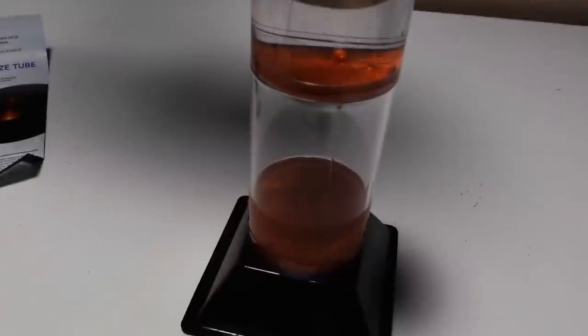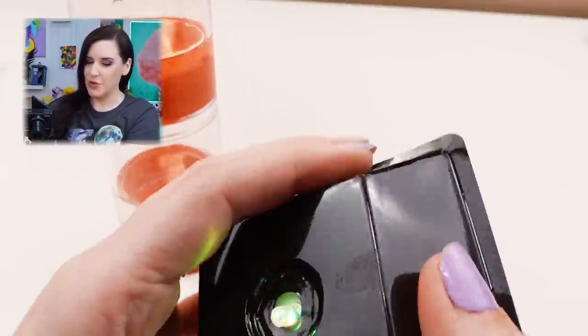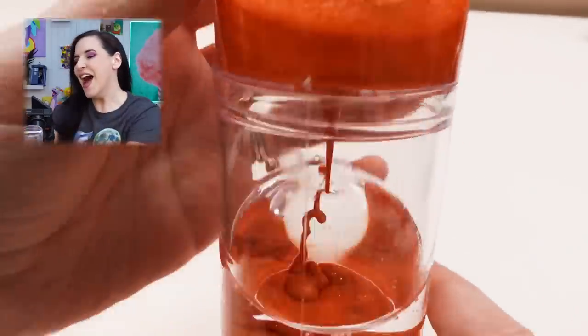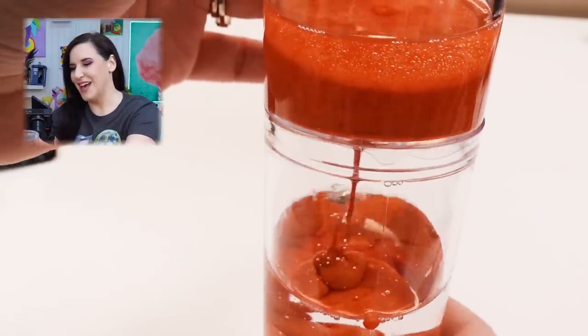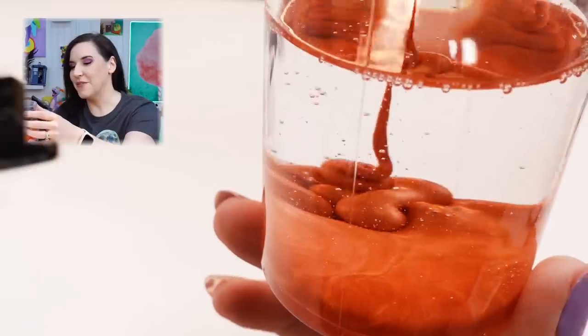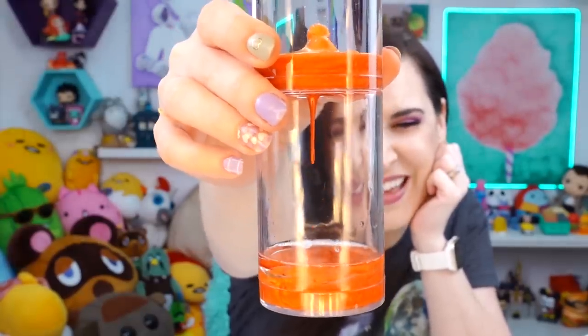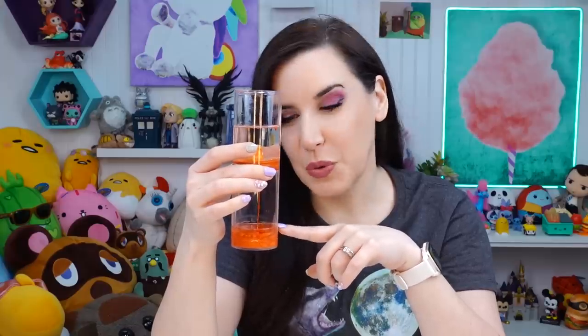Let me turn all the lights off. You can't even see it — I mean, that's the light, like right here, you guys — that's it. So this base is just absolute nonsense. Not only is it super cheap plastic, but you can't even see it. I mean it's kind of interesting, sort of satisfying maybe — that's neat, look at that. I kind of like that. I don't know what I feel about this project. My emotions are all over the place with this one. When you buy these things at Five Below you literally haven't spent that much money — somewhere between three and five bucks. And so you can't be like 'it wasn't worth the money.' It is kind of interesting and neat. I don't hate this. Watching the silicone pool down in there is pretty cool.